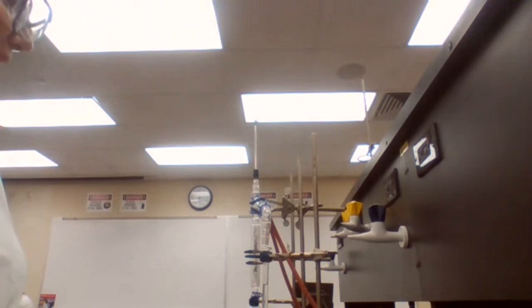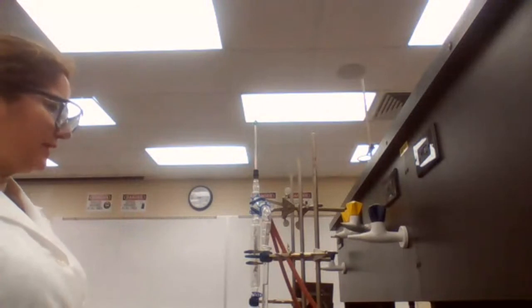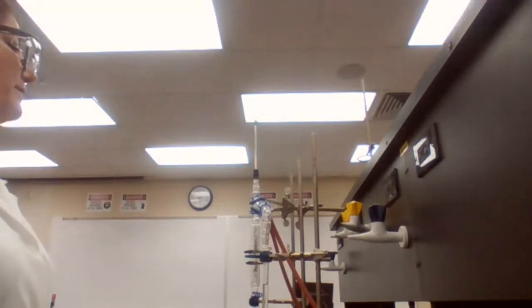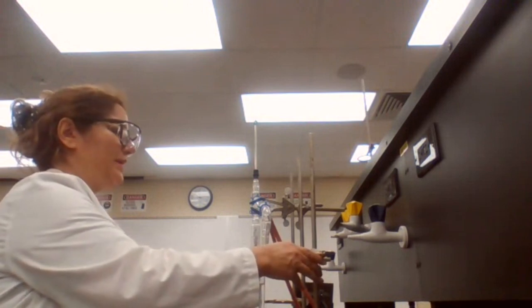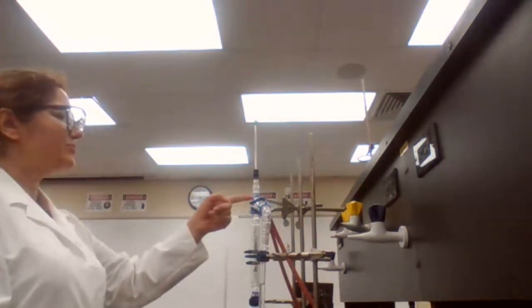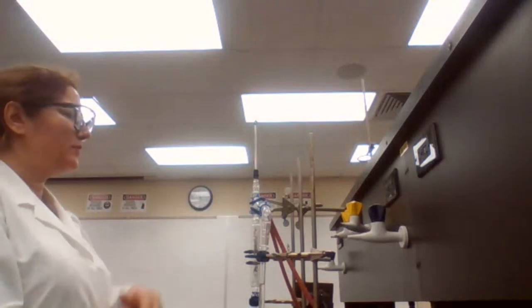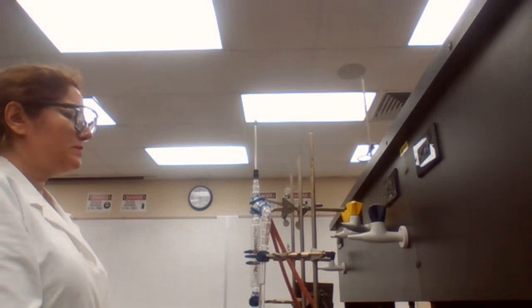Wait until the vapor inside the flask condenses back, because we don't want to open it right now. If you open it, you're going to get the vapor coming to our face, and we don't want that. We're not going to take the graduated cylinder quickly because there might still be a drop coming, last droplets from the vapor remaining in the condenser.